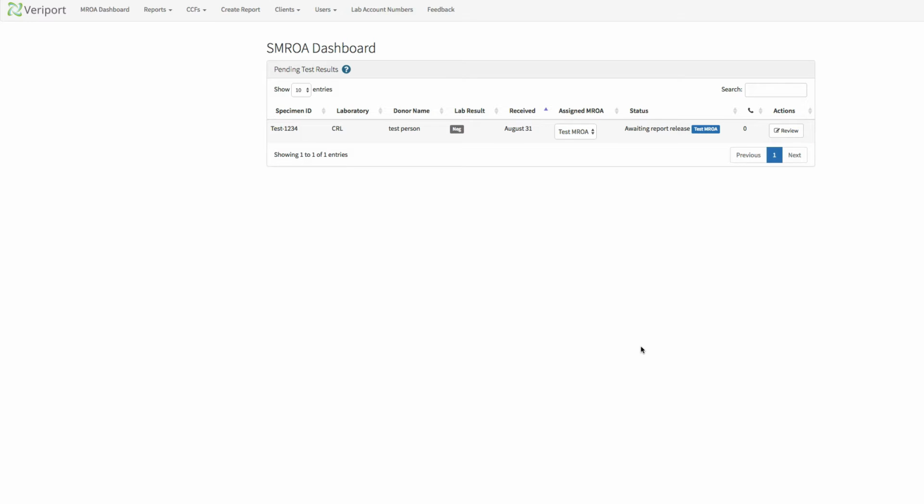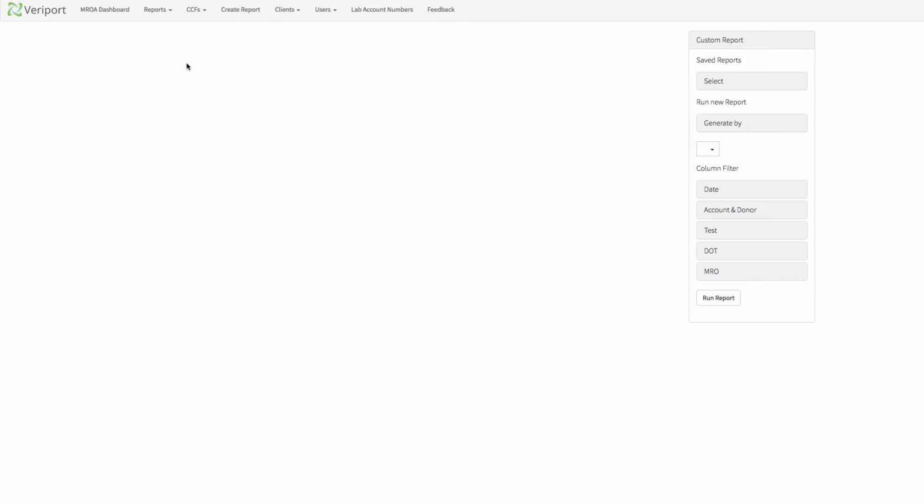Today we will be reviewing the reporting interface that allows for the compiling and export of system reports. You can see here that we are logged into our test and demo environment. To access the reporting interface, click on Reports and then click on Export Data. This will take you to the reporting page.